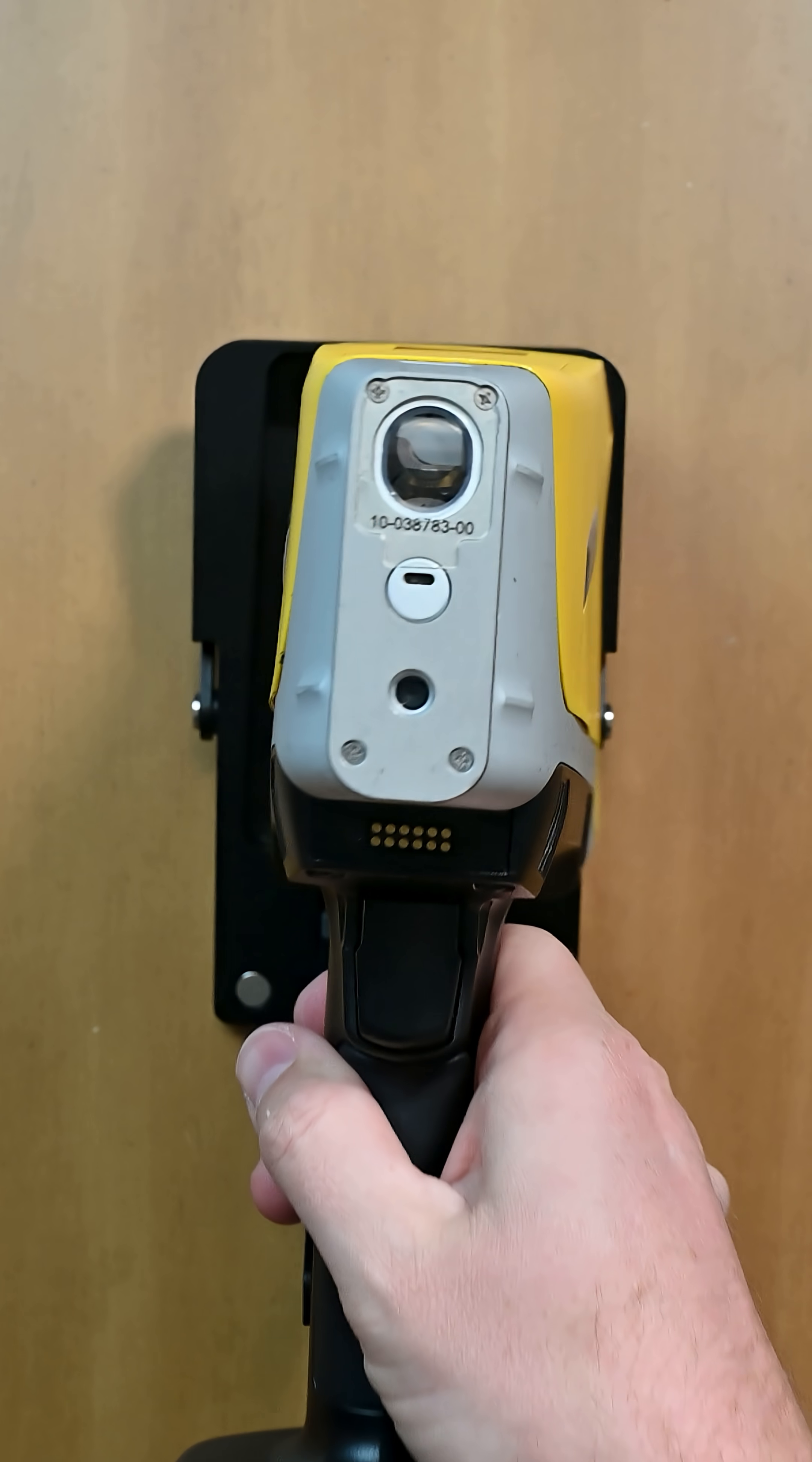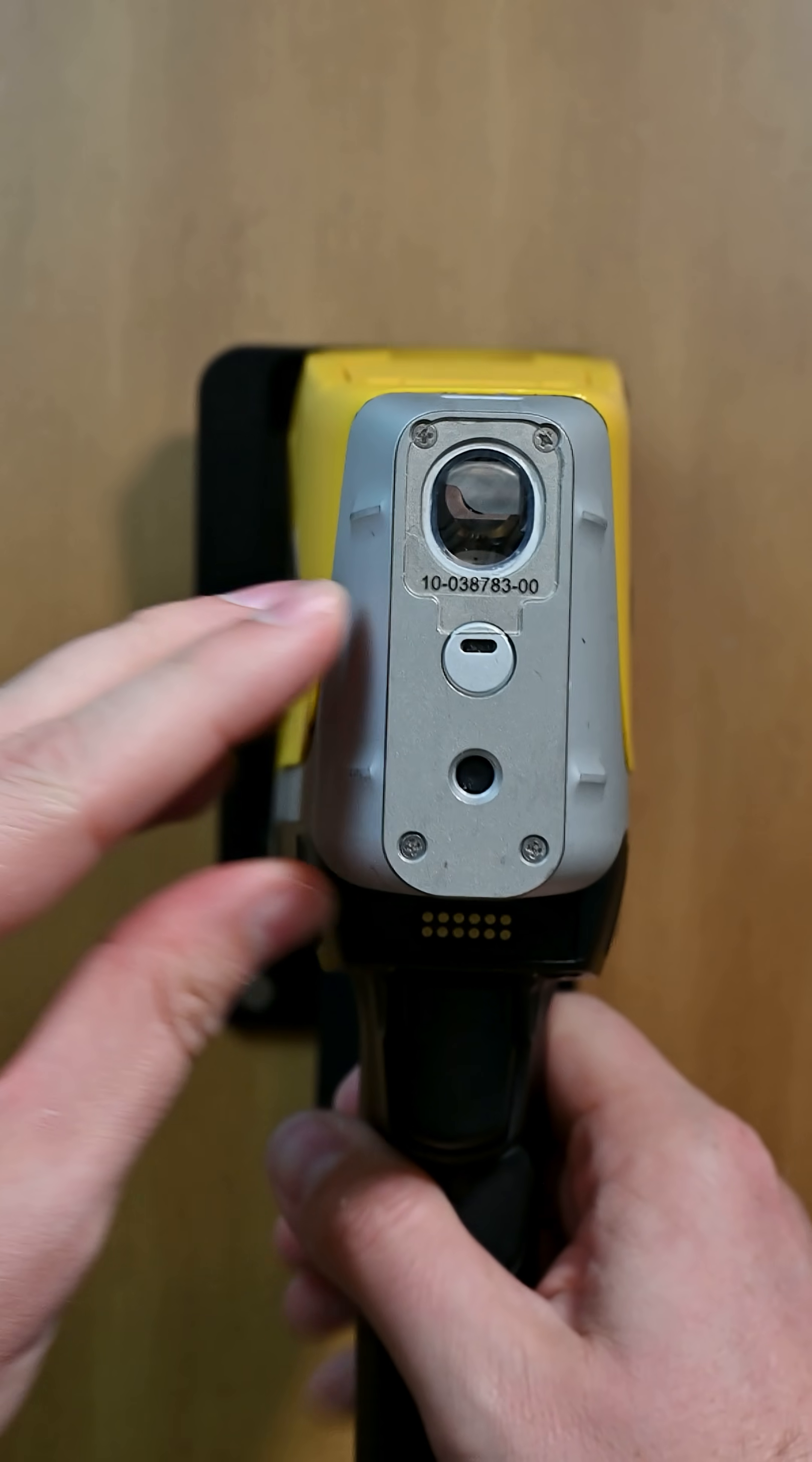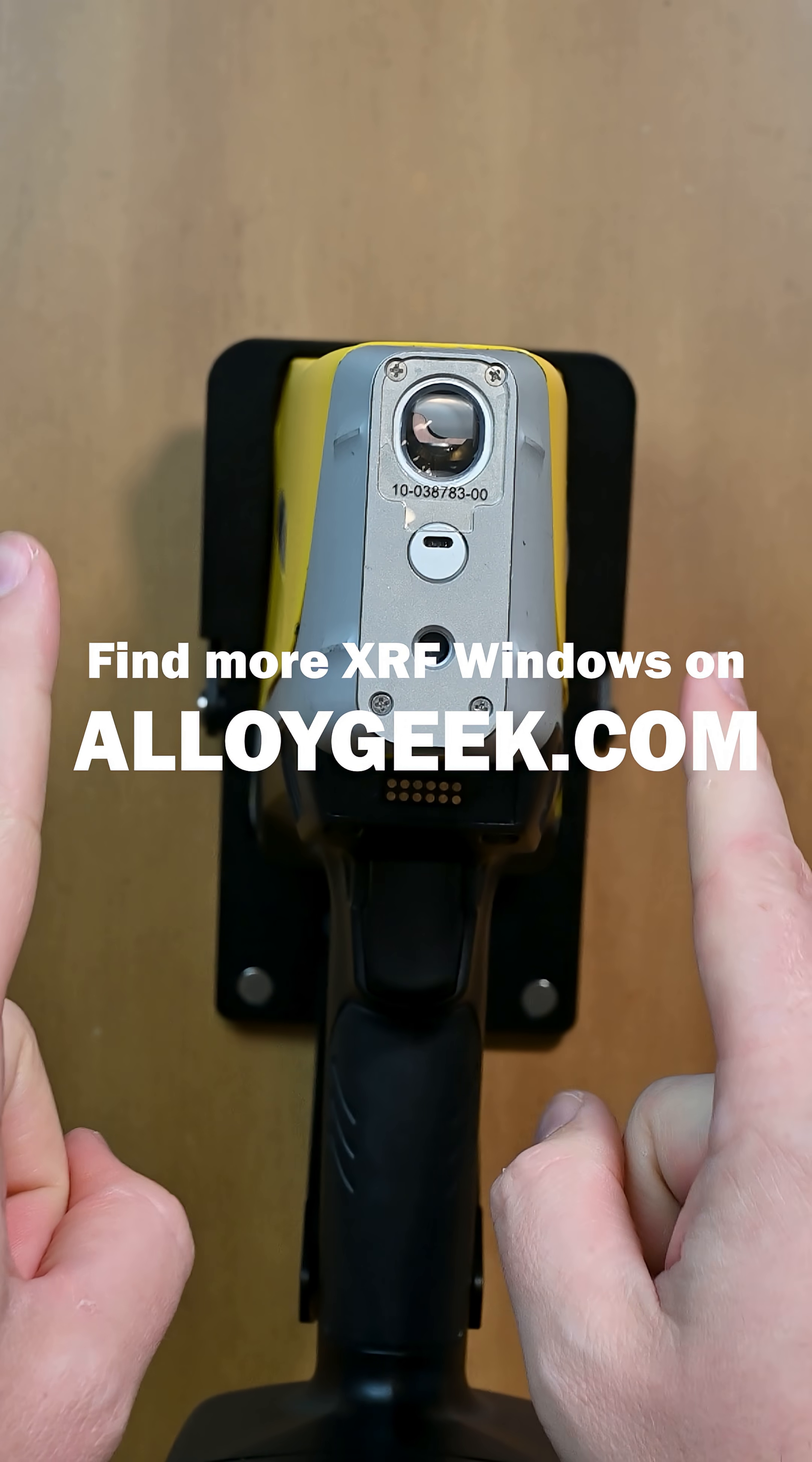And there you go, you have a brand new window on your Vantamax, and you're ready to go and get back to testing. You can find more windows on AlloGeek.com.